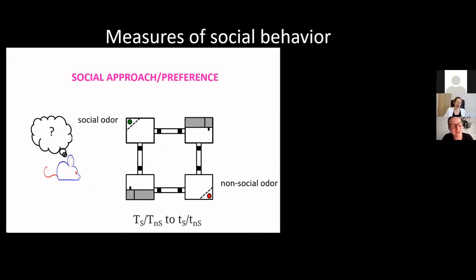So commenting on this a little bit more, obviously it happens less that females become aggressive, but nevertheless, we know strains that have aggressive females and we coped with them in our own experiments. So it's not completely uncommon.